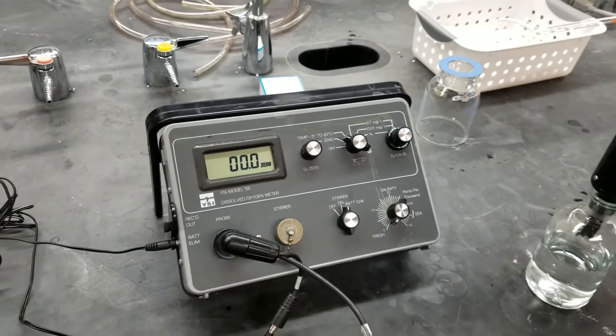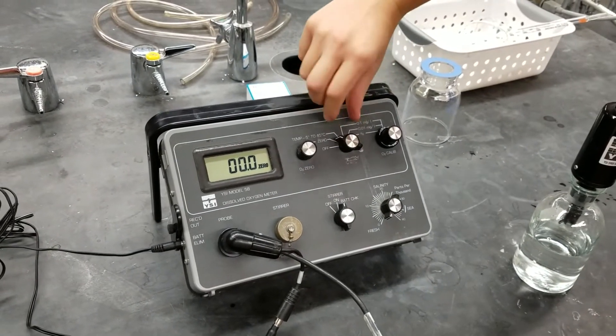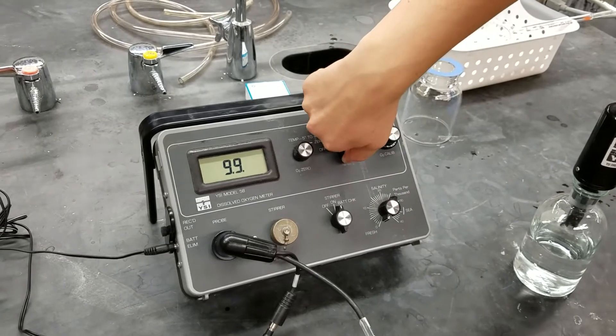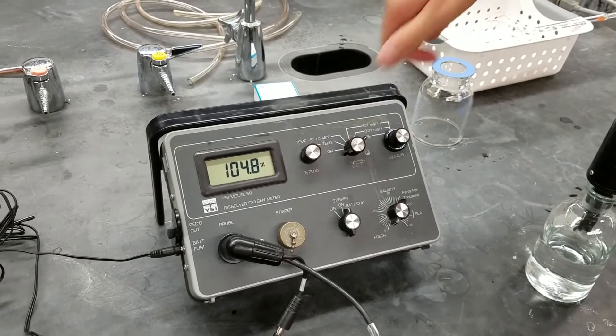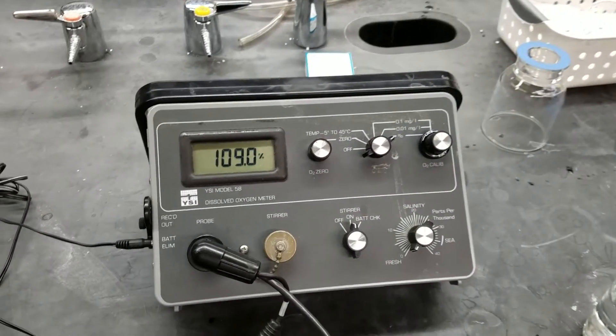And then the other thing we need to do to calibrate it is flip this knob over to the percent setting. And we want this percent to be 100.